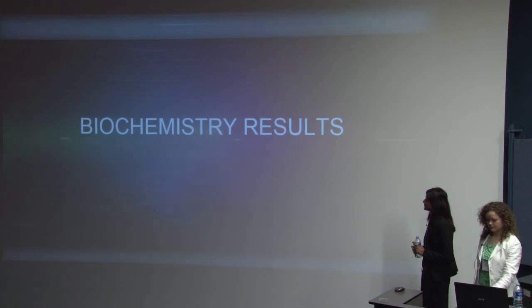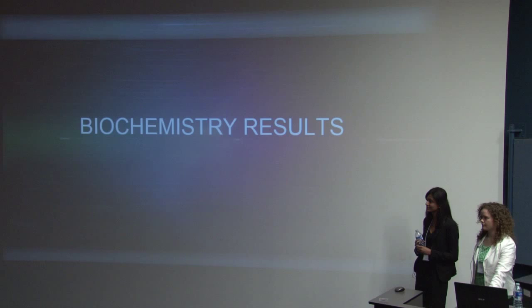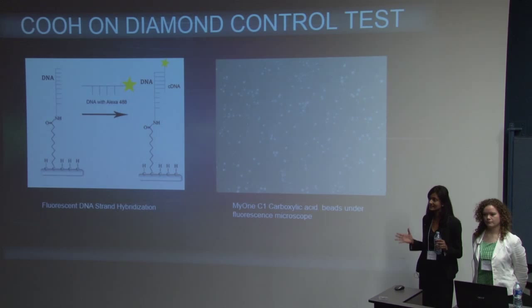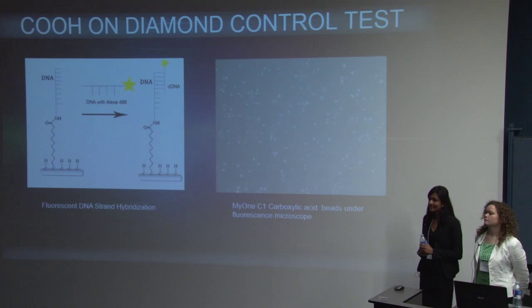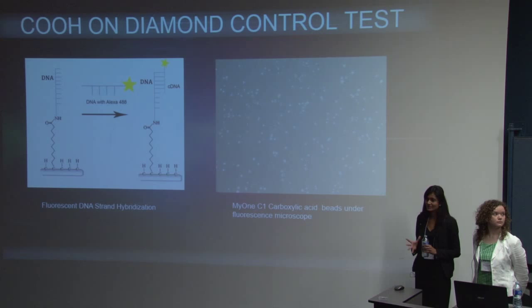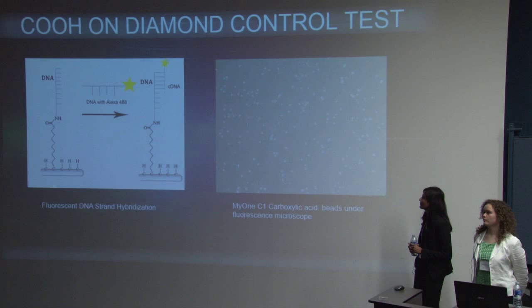Now I'll take you through some of the biochemistry results we obtained in order to test our setup. The very first thing we had to check is, can we attach DNA aptamers to a carboxylic acid terminated surface? For that, we used carboxylic acid beads supplied by Sigma Aldrich. These beads are known to have a coverage of 10,000 carboxylic acid strands per bead. Surface area is much higher compared to the diamond, but we still have carboxylic acid beads. We did the EDC reaction and were able to attach the DNA aptamer, but we need to validate that.